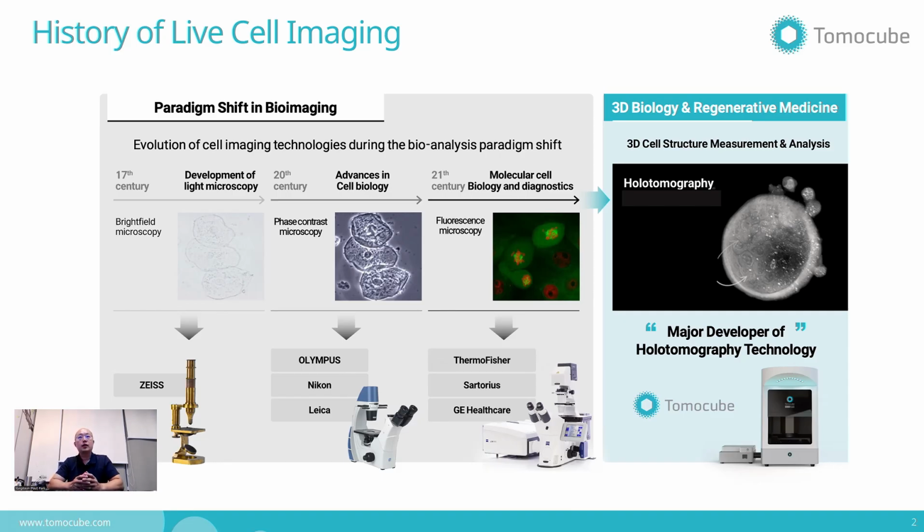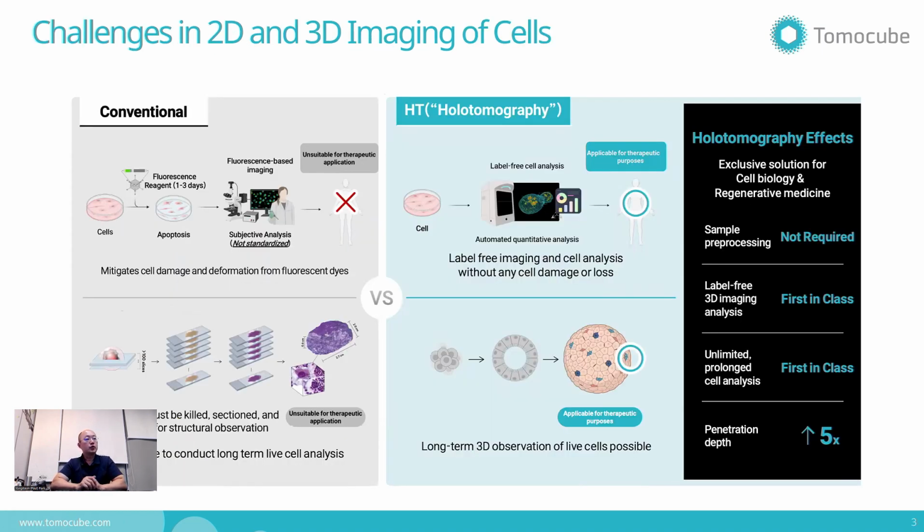And then in order to use those samples for therapeutic and reproductive processes, we have to keep them alive and intact without using any exogenous labeling agent. And that's why we are working on label-free imaging techniques. In particular, we are interested in using the refractive index as imaging contrast.